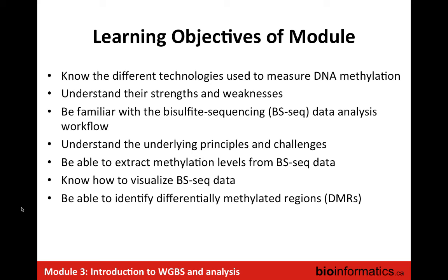We also want to understand the principle and the challenges of methylation analysis, be able to extract methylation levels from bisulfite sequencing data, and know how to visualize bisulfite sequencing data. In this module, especially in the practical, we'll be using IGV, the Integrative Genomics Viewer, to look at some of the files. This is slightly different from what you saw yesterday, which were mostly UCSC genome browser tracks. Here we'll retrieve the data locally and visualize and explore it. And then be able to identify differentially methylated regions. This we'll cover in the lecture, not as much in the practical, so that you have a sense of how you identify differentially methylated regions.